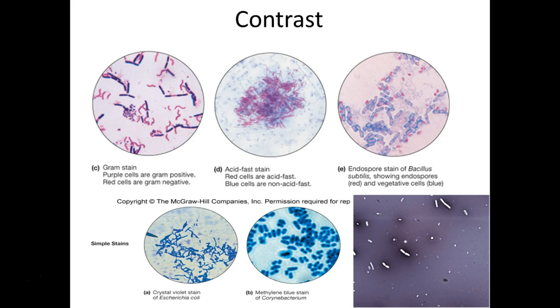So bacteria in general are transparent, right? Some of them have pigmentation to them, but a lot of them don't. So in order to see them, a lot of times we stain them. And some of the stains that we do actually tell us more information other than what you see here, of all these different shapes and colors. The different colors actually mean something.